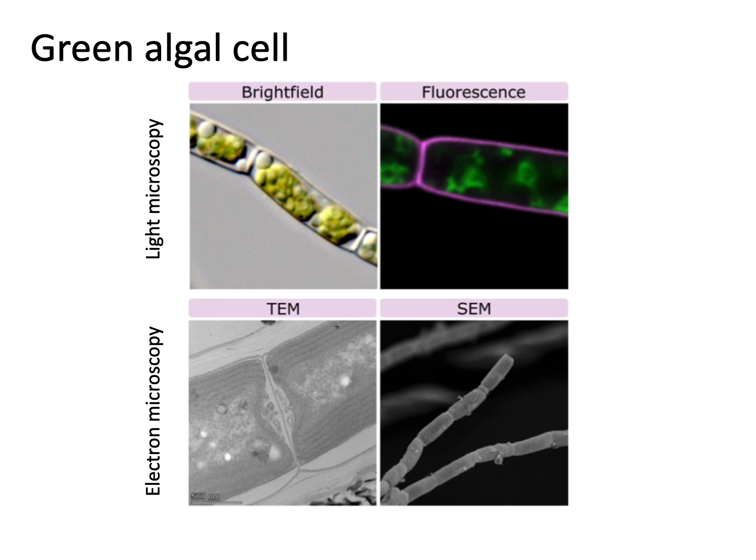Now to the right, notice that this looks more like where the electrons are coming down from on top. You're not looking at electrons coming through, but you're looking at topological structures. This is like the comparison between transmission and scanning in stereo microscopy, right? Where you need light going through or light coming from above. Same thing with the TEM, which is transmission electron microscopy, electrons coming through. And scanning electron microscopy is the electrons being cast down from above, and what you're detecting is the way that they scatter off of your material so that you have three-dimensional physical shape information.